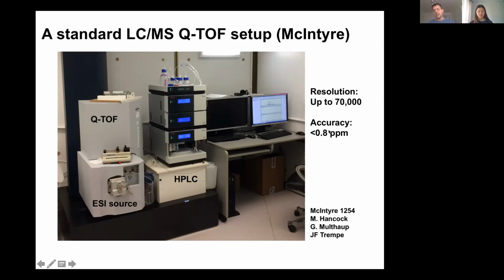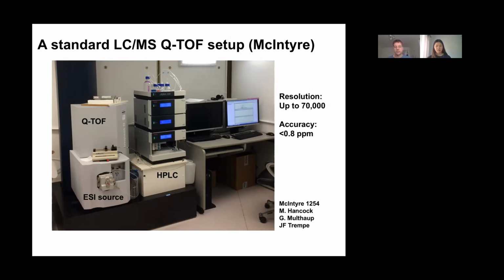And what this means is that for even something up to 1,000 Daltons or 1,000 mass to charge or 10,000 mass to charge, the mass accuracy should be within a fraction of a Dalton. So this is a really, really, really sensitive technique when your instrument is working properly.